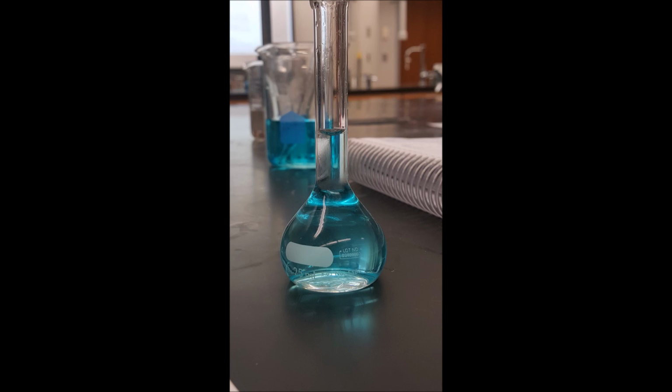Today we're going to talk about how to do a dilution lab. First, you're going to begin with getting your stock solution and transferring it from its container into a beaker.